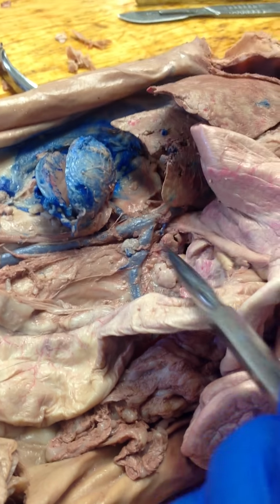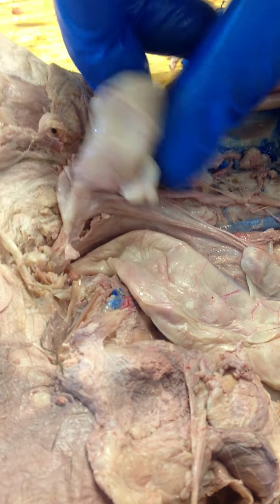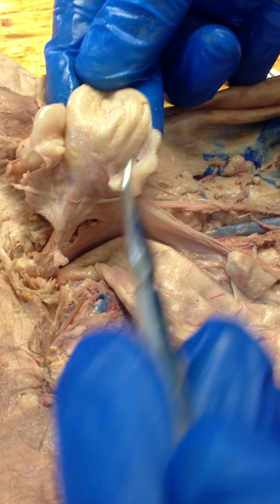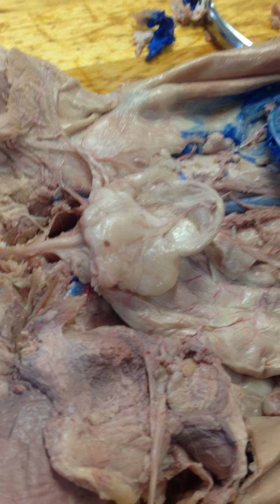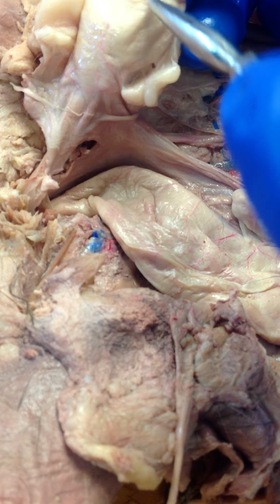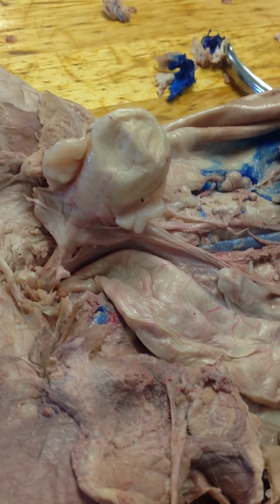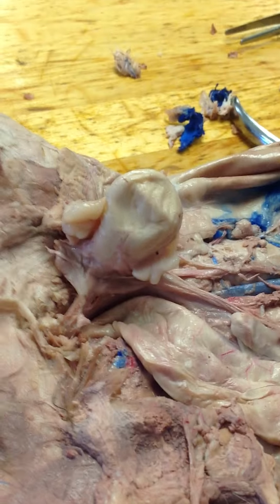Okay. Urinary bladder. It's in this mess of fat here. The bladder itself is this sort of circle. Fundus and neck: the fundus is at the top, and the neck is at the bottom, the skinnier part. Urethra extends off of the bladder and goes all the way out.